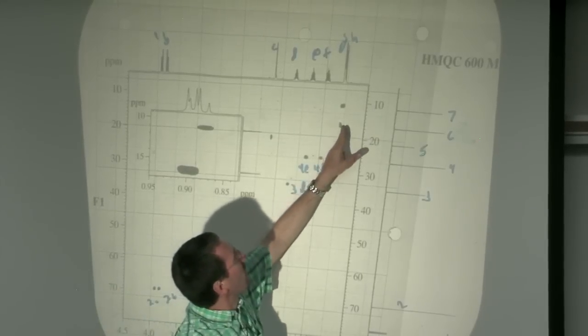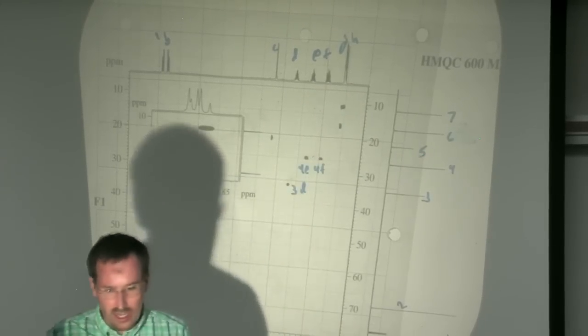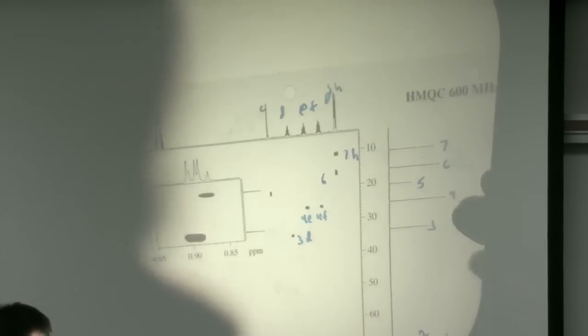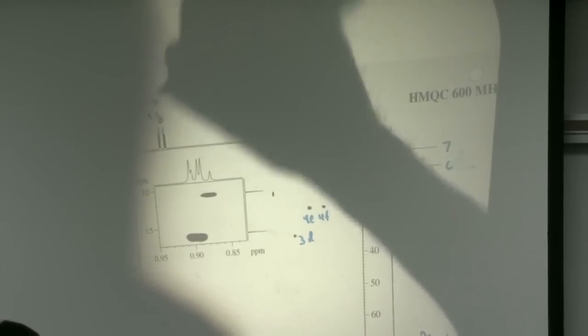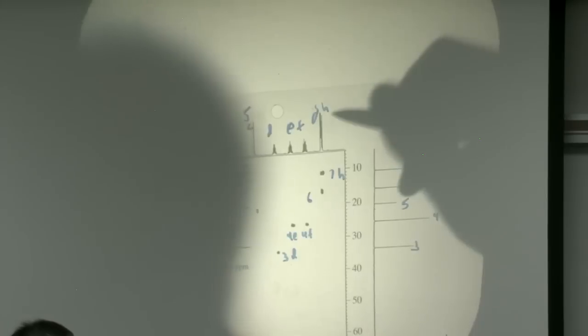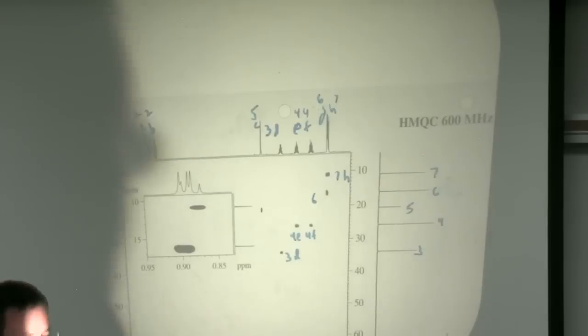So here I look and I see, oh yeah, you see how nicely you can see with the grid lines, this lines up with G, this lines up with H. So okay, we get 6G and 7H. And now this is going to become my Rosetta Stone for the problem. I'm just writing all of my numbers here right over the letters: 2A and 2B, 5C, 3D, 4E, 4F, 6G, and 7H.